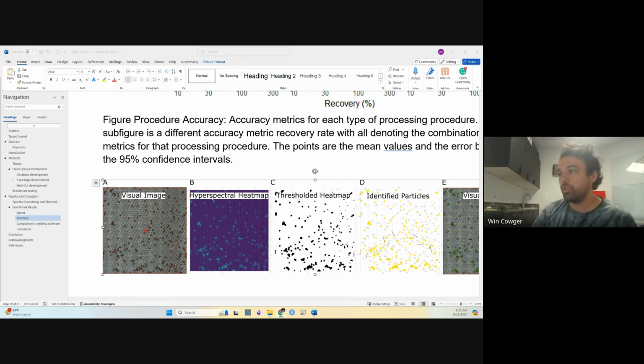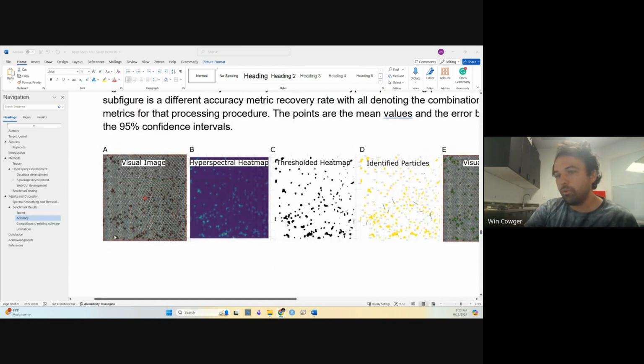Good question. So yeah, focal plane array is one technique. Here at the Moore Institute, we have a linear array, which is similar to a focal plane array, but it has fewer elements. We have like 16 measurement spots that we can hit.